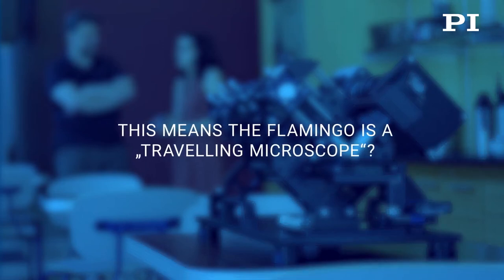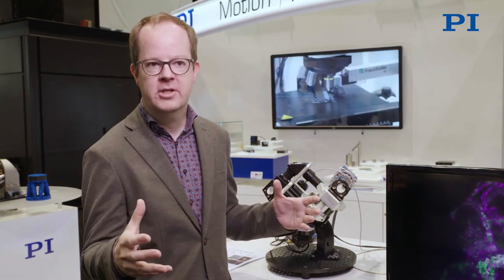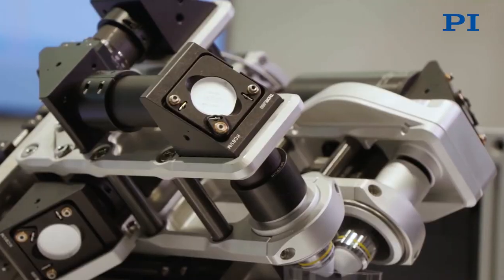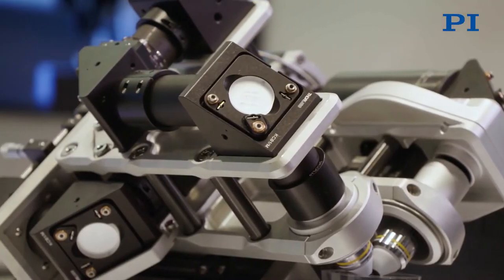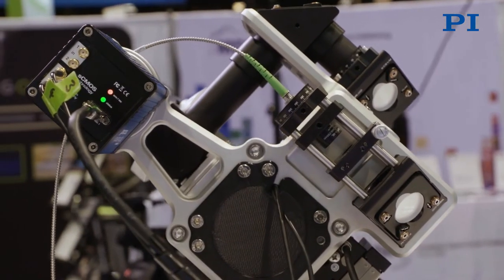How do you build the microscope in the lab? Typically, the microscopes in the lab are built on big breadboard tables, optical tables, and the building process of such an instrument can take a year or two. Now, with this modular system that took us about two years of development, we can build these instruments in about a day.